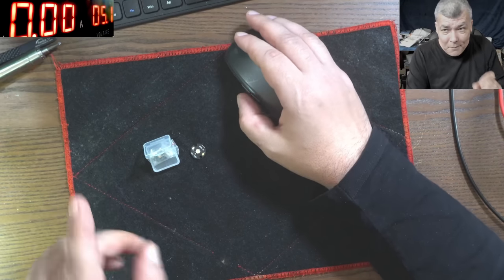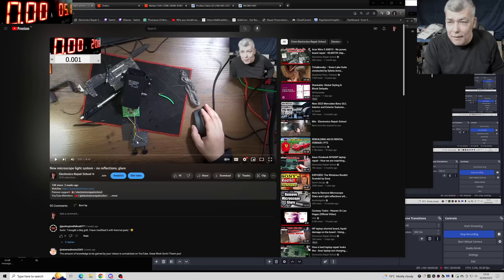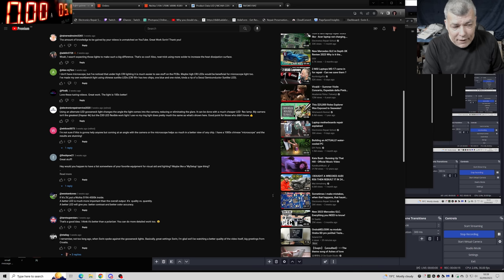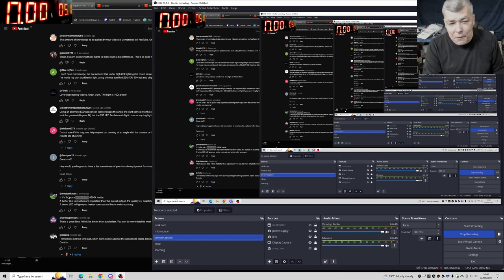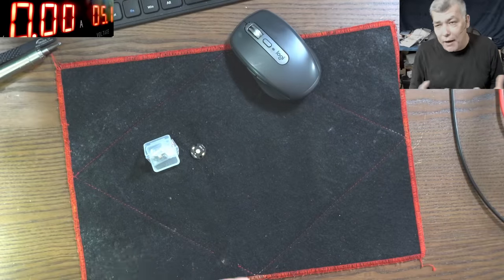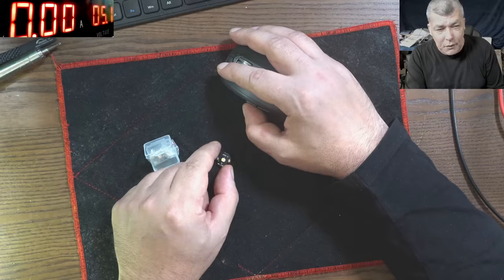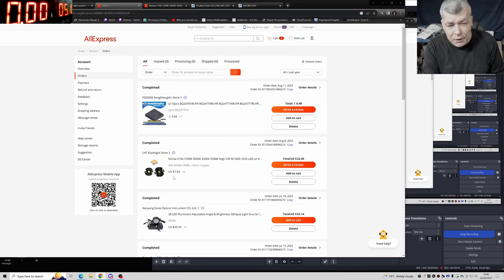Hello, we are back. Remember this video? I modified the microscope light to have a little bit more light. Anyway, someone left a comment and I want to thank you for that. I want to speak about these LEDs, the Nichia 519A, because I did some research to find out these are some kind of high-efficiency LED. I ordered from AliExpress — around seven pounds each.